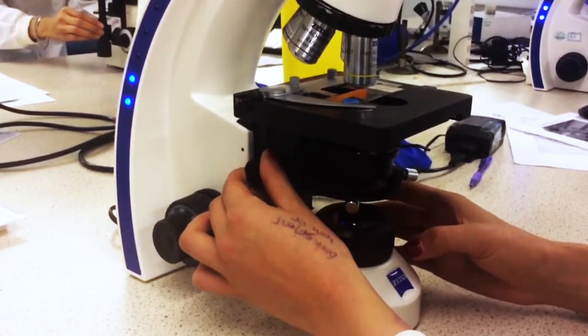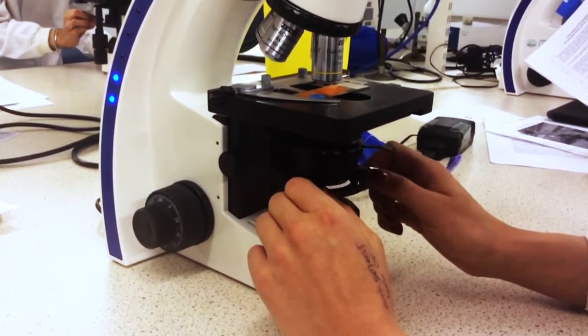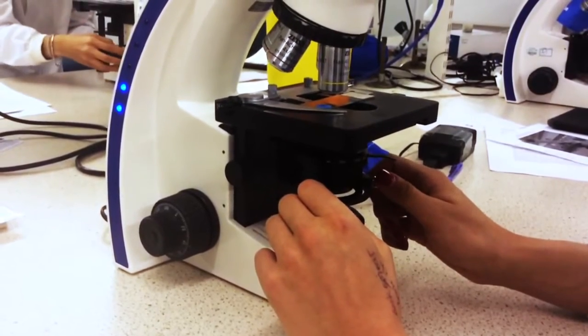Carefully rack the condenser up and down using the condenser wheel. Doing so, a black outline infringing on the field view will appear. Use the condenser centering screws to make the field diaphragm image concentric with the edge of the field of view.